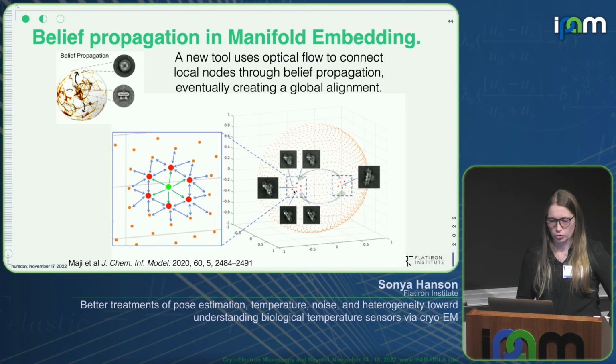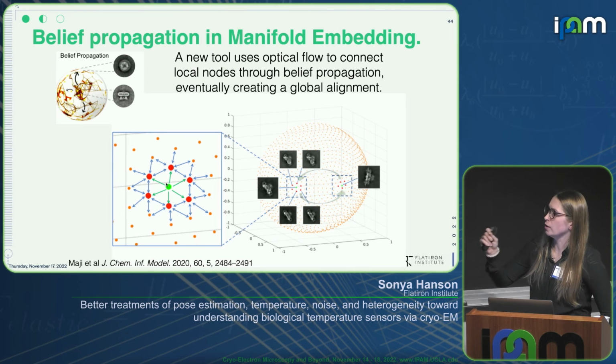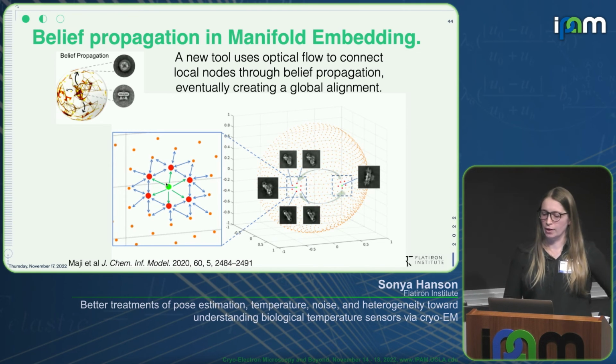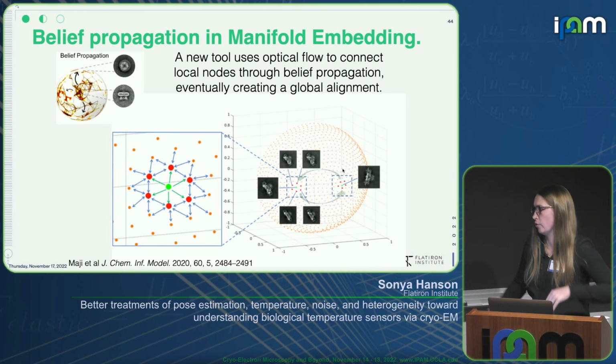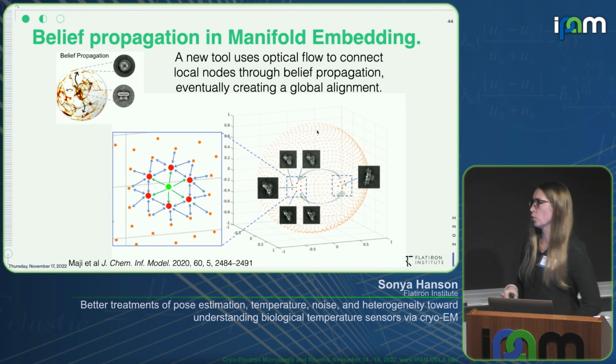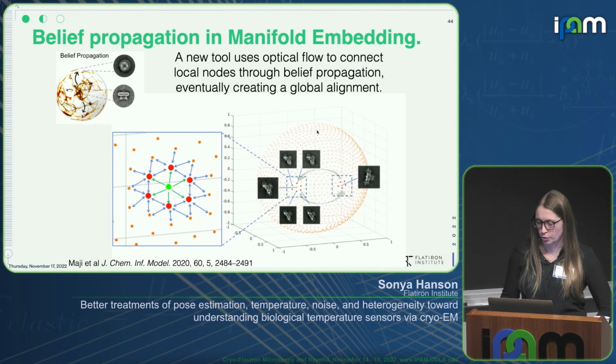To show this in a bit more detail, in his method, you pick anchor nodes where you define the conformational change to be in the positive direction, and then in other anchor nodes, for example, going up to down in the case of these wings of ryanodin receptor, you make sure that it is the same order of conformational change in all of the other anchor nodes over the orientation sphere.